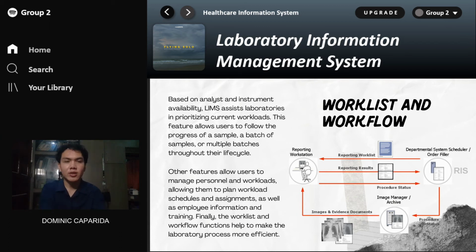They can give it to the doctors, or if it's stat, they can immediately administer the results. So they literally organize from this work list and workflow. This also features allowing users to follow the progress of a batch of samples, or multiple batches, throughout their life cycle, as you can see in the diagram or the figure.